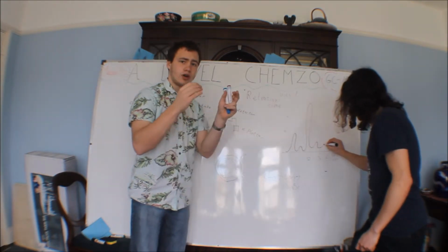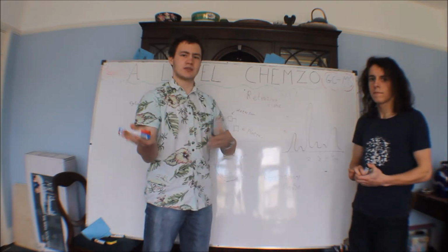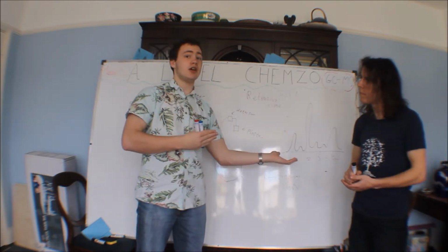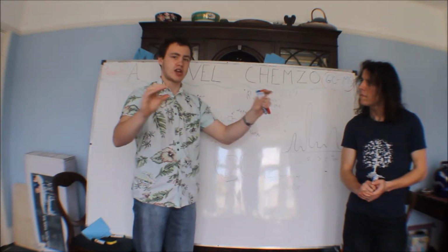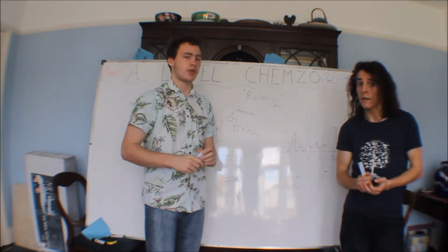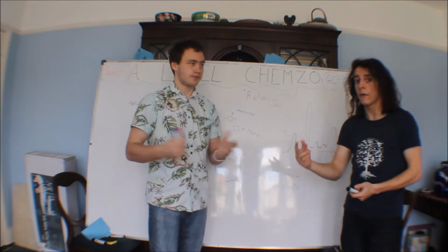And you can look at your other data and suggest that different peaks would be certain things, perhaps if it's a perfume, a ketone, or an aldehyde, and alcohols, so the shorter chain ones are pretty volatile. Yeah, so methanol and ethanol. Like in your book, we'll have set things that we'll be able to look at.